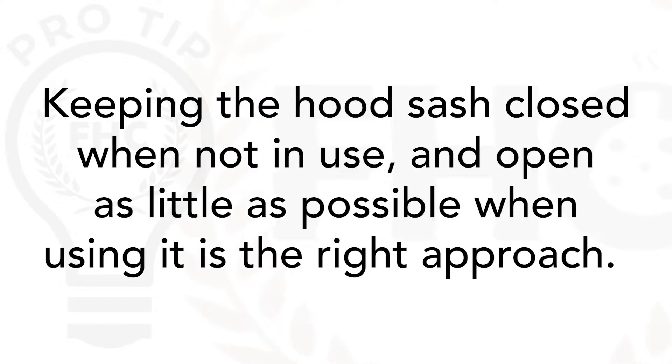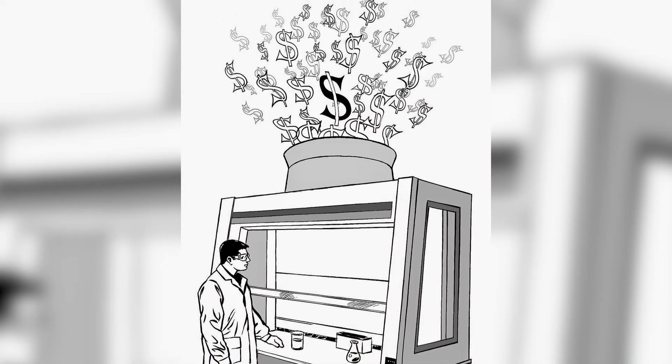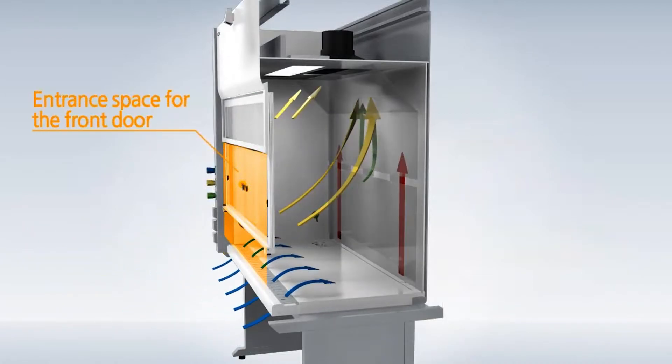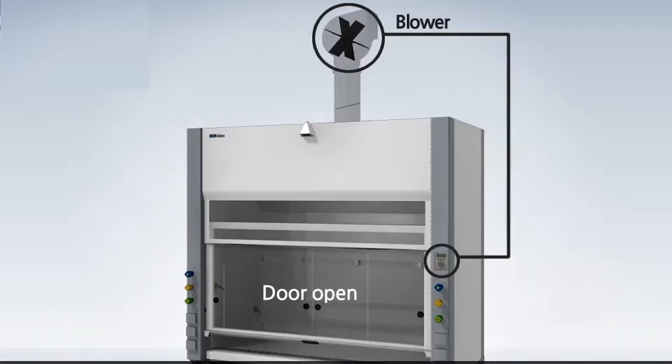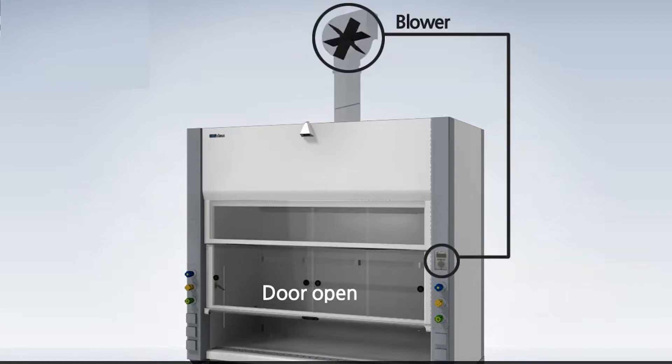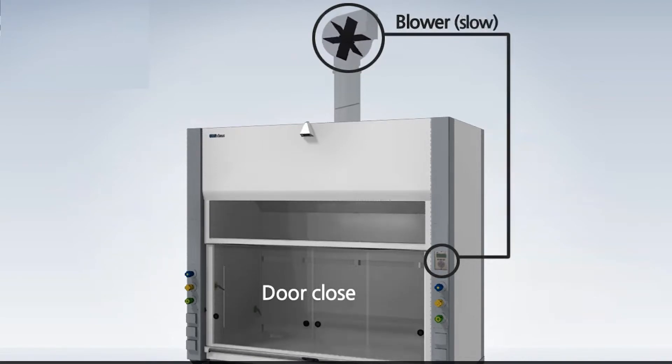Whatever type of sash your hood has, keeping it closed when not in use and open as little as possible when using it is the right approach. The glass is there to protect you from the hazards. Fume hoods are very expensive to operate — they require large amounts of air to function properly. In most modern hoods, the amount of air used is determined by how much the sash is open. The smaller the opening, the less air and energy the fume hood will use.